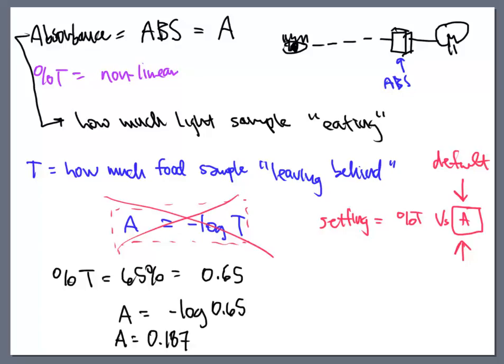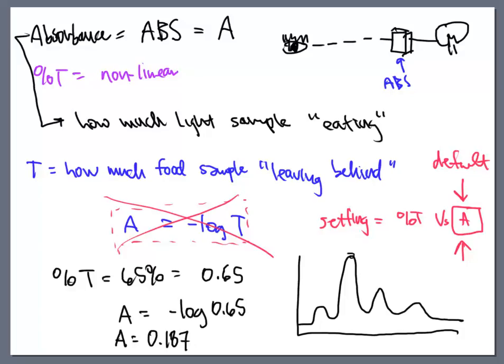So therefore, on the spectrum, when I began to scan these samples in the beginning, I told you that there's 2 things that are happening here. One of these is the Lambda Max. This is telling me my preferred food item from the buffet, or the preferred lambda from the buffet of electromagnetic spectrum. Well, over here on the y-axis, what is that unit? That unit is absorbance. How much food is it putting on its plate?